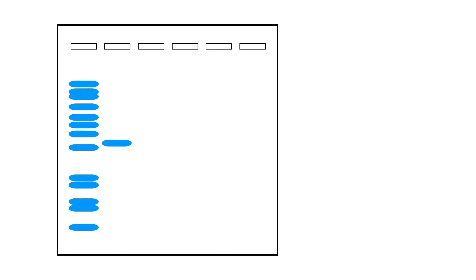So this is the gel that I use in the original video and it's got six lanes in it. In lane one are the base pair sizes, the DNA ladder, and what we need to know is the size of this unknown band that's what we're trying to calculate.